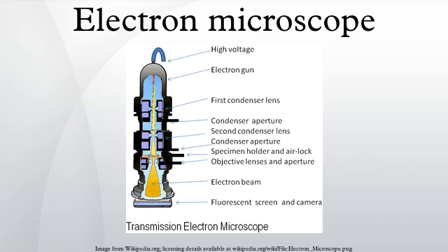Some types of detectors used in SEM have analytical capabilities, and can provide several items of data at each pixel. Examples are the energy dispersive X-ray spectroscopy detectors used in elemental analysis and cathodoluminescence microscope systems that analyze the intensity and spectrum of electron-induced luminescence in geological specimens. In SEM systems using these detectors, it is common to color-code the signals and superimpose them in a single color image, so that differences in the distribution of the various components of the specimen can be seen clearly and compared.